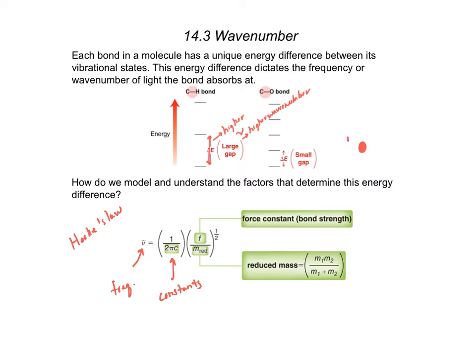We're going to call that mass number 1. We have a spring attached to them, and this is atom number 2. We'll call this mass number 2, okay? So this is going to be our carbon-hydrogen or carbon-oxygen and vice versa, okay? Again, we're looking at the frequency of the spring and how much it vibrates, okay? So we're ignoring this because it's just pointless, right? There's a square root here, but we really don't care about that.